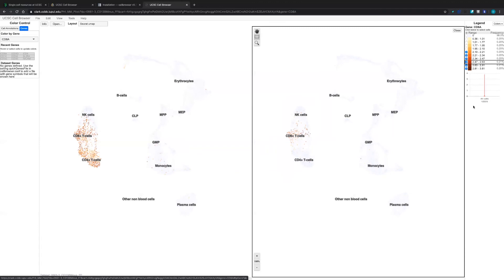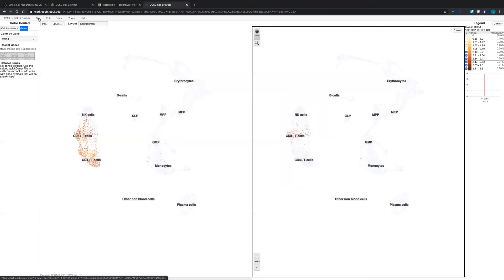If you think this is an interesting result and want to save these figures to your own computer, UCSC also provides this function. You can choose it from the File menu — there is a button called Download Current Image. You can click it and the image will be downloaded to your computer. That's all for this brief introduction about how to use the UCSC Cell Browser. Hope it is helpful. Thank you.